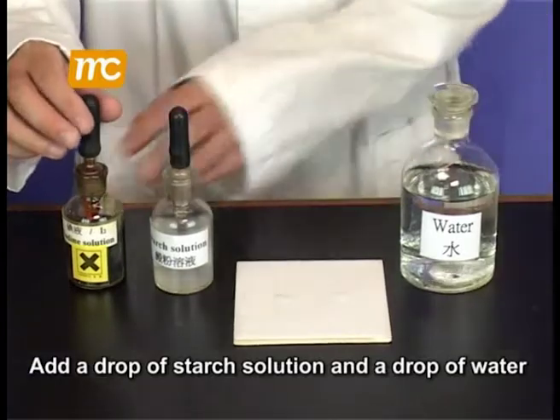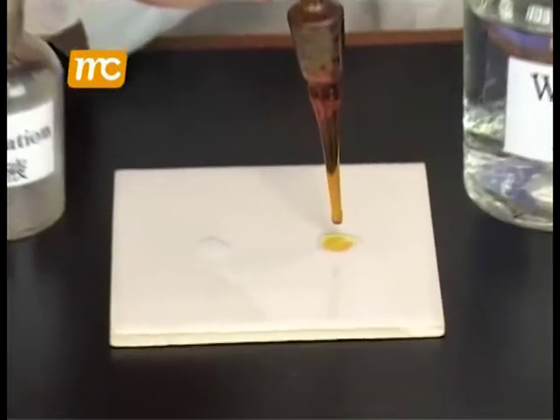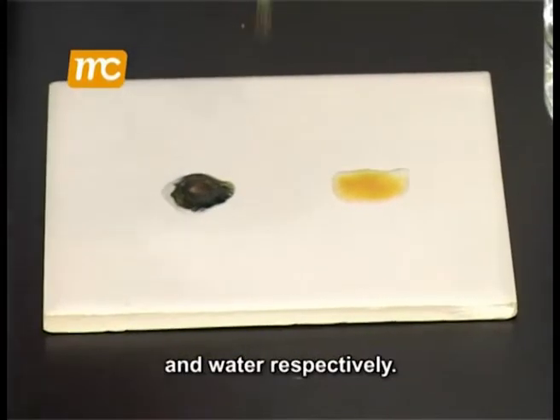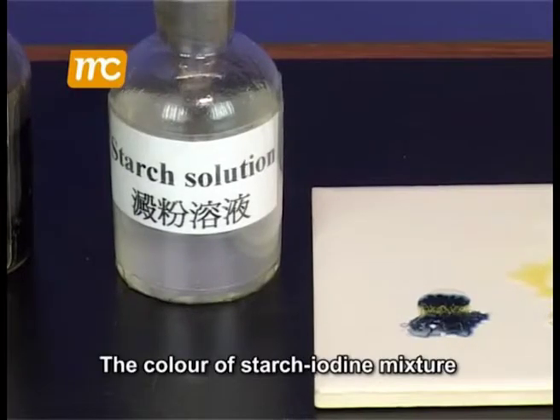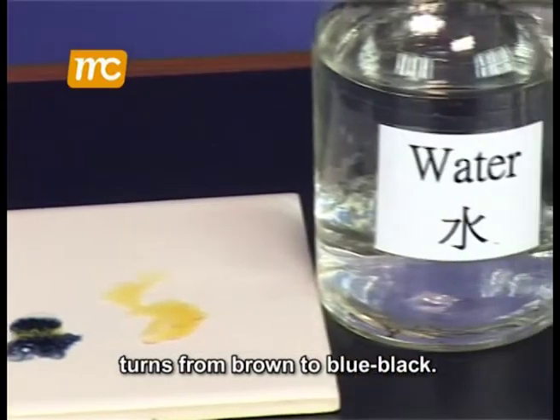Add a drop of starch solution and a drop of water onto a white tile. Add a drop of iodine solution to the starch solution and water respectively. The color of the starch-iodine mixture turns from brown to blue-black.